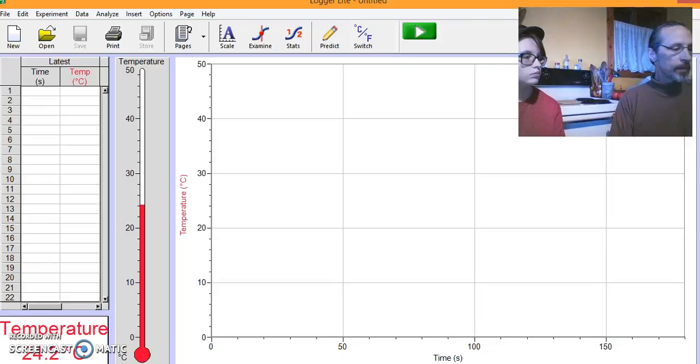So when we're running the experiment, I want you to think about the energy being absorbed by the molecules, okay? And when we're looking at the data, we'll be recording temperature, but temperature is another way of saying more heat in the system. So think about the energy.